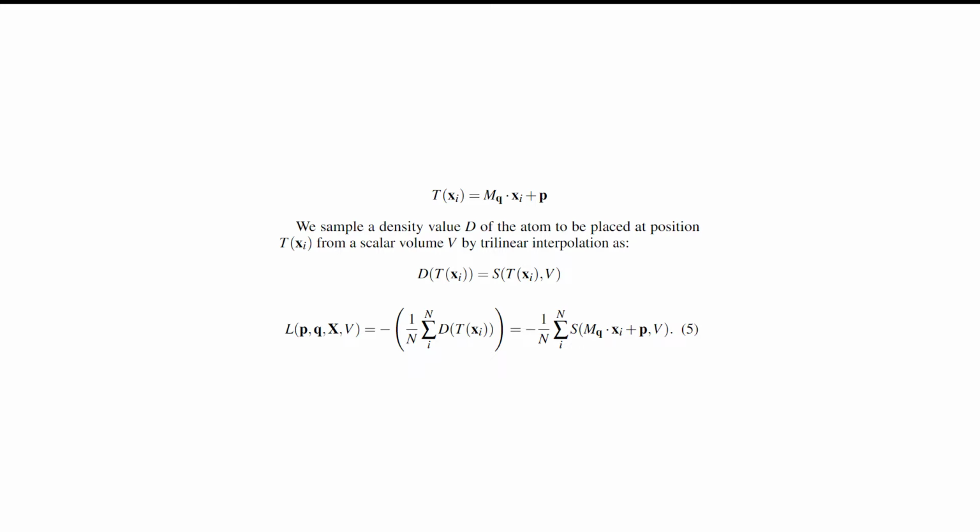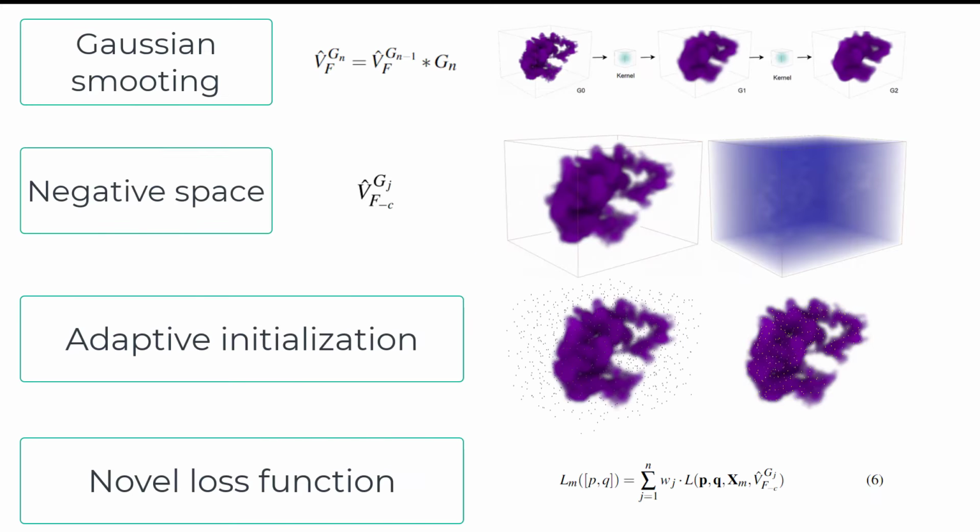First, we need to extend Reddy's approach to work in 3D. Then, we need to come up with a new loss function to handle the different properties of the molecules and volumes from 2D images. Then, we developed several novel strategies to process the data and created a novel loss function. As a result, our algorithm performs robustly and tackles the local minima issue very well.